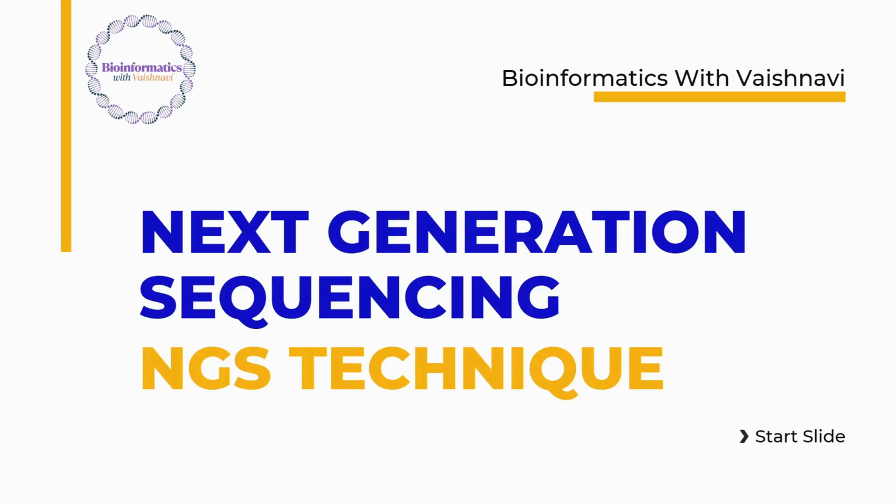In this video, we will understand next generation sequencing, also called NGS, and we will compare it with the traditional Sanger sequencing method. This video will help biotechnology and life science students understand why NGS replaced traditional sequencing techniques.